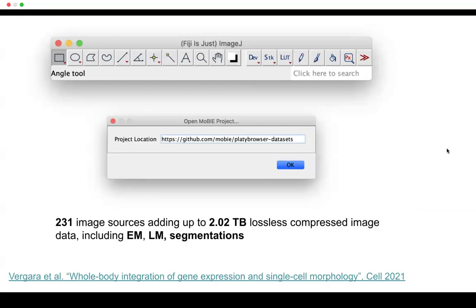So it's not possible to put also the images on GitHub because GitHub is not a place to put terabyte sized binary data, but the small text data is actually conveniently managed by GitHub. So now if you have the MoBIE plugin and you have such a GitHub hosted project, for example here, this was the first one we did, the so-called platy browser, which is hosting the data from the publication down here. You only need to enter this GitHub location and then you press OK and then it will for you stream data from the cloud. And in this case it's 231 different images, EM, LM and also segmentation data, adding up to a bit more than two terabyte. So I wonder how well this will work from Australia, to be honest, since this is where your listeners are sitting right now, because it's very far away from EMBL Heidelberg. So please try it and maybe you can send me a mail how it works.